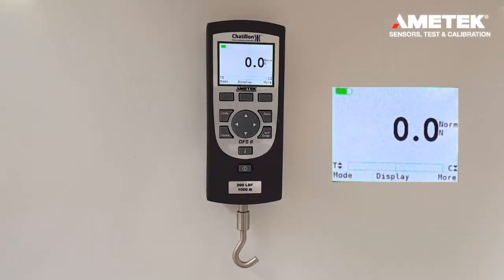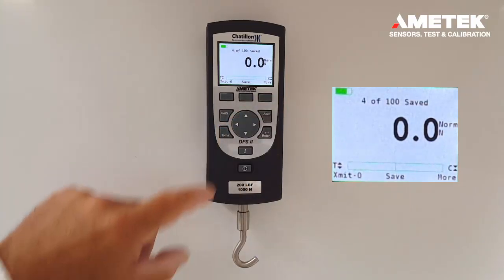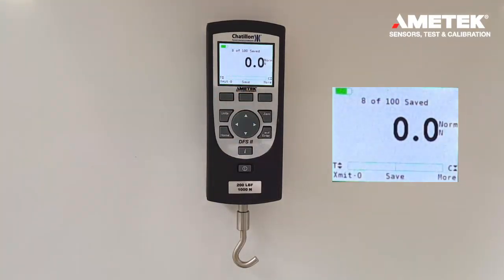This video is going to demonstrate how to clear saved data on a DFE2 and DFS2. If you press the more button and start saving data points, we can save up to 100 data points on a DFS2 and 20 data points on a DFE2.